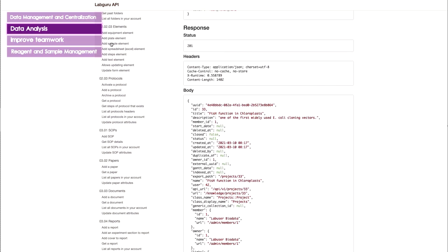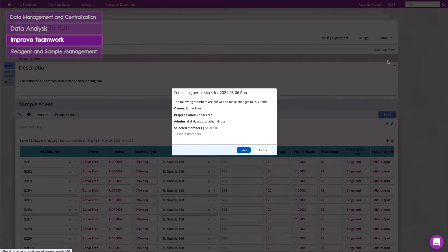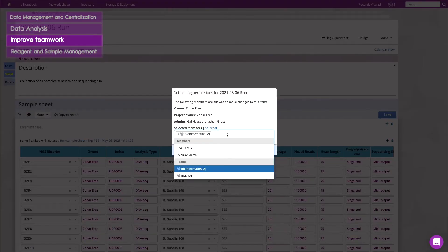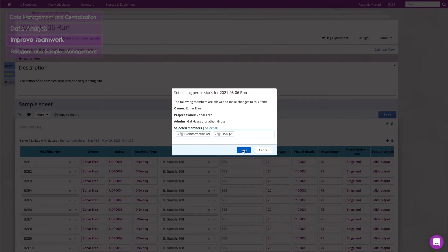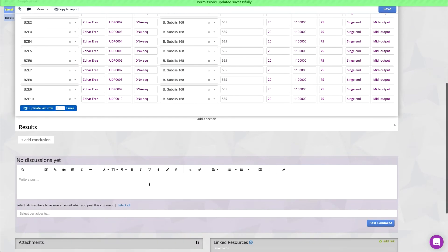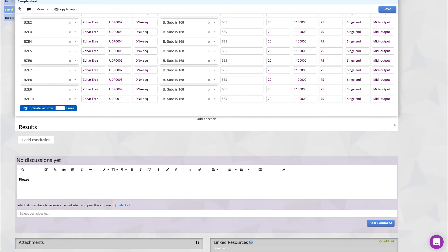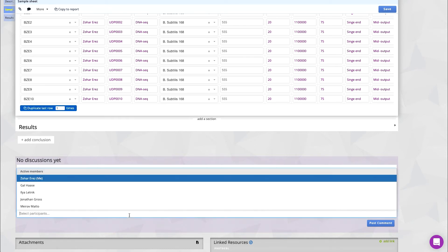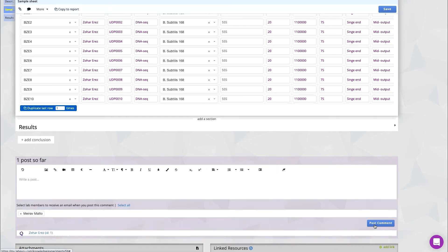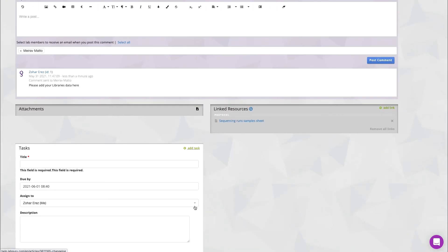Let's check out how LabGuru helps improve teamwork. Easily communicate with other lab members or different teams by creating shared experiments, commenting, and discussing. Assign tasks to lab members to make sure you stay on top of all your projects.